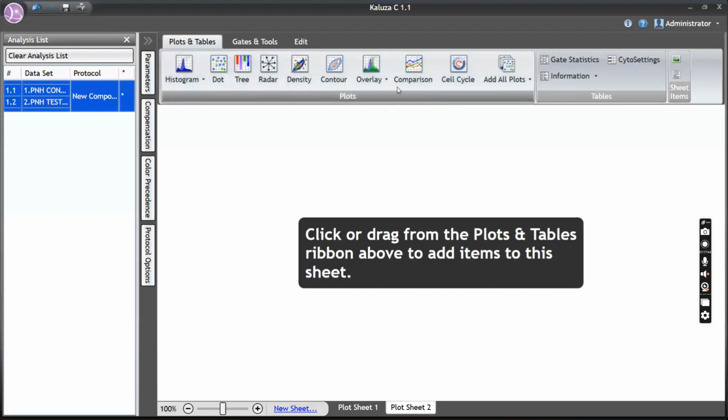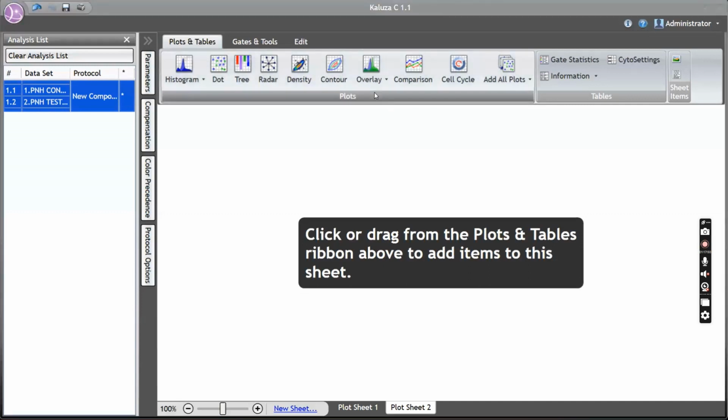Sir, you had told that for neutrophils and monocytes, we should always use 2 markers for PNH diagnosis. Correct. And for RBCs, 1 can be used. Yes, but I also said that you always need to start with PNH analysis on WBCs. Once you have found a clone, then you can check it on RBCs. So it's basically to increase the sensitivity of the assay.